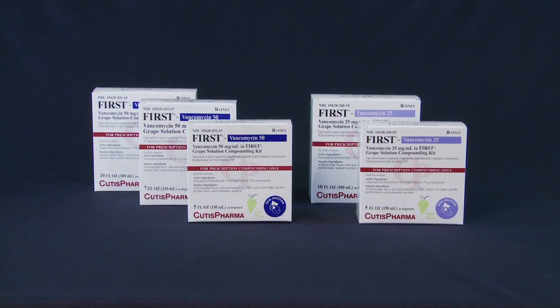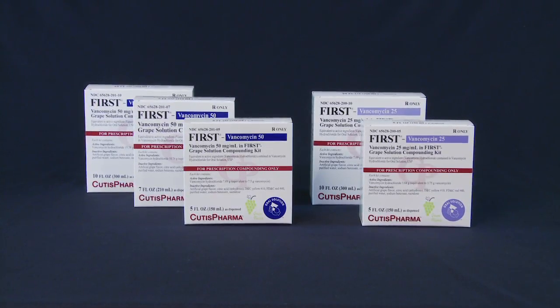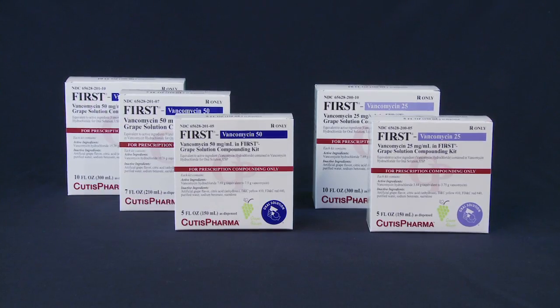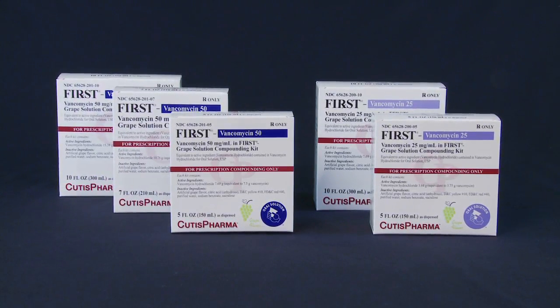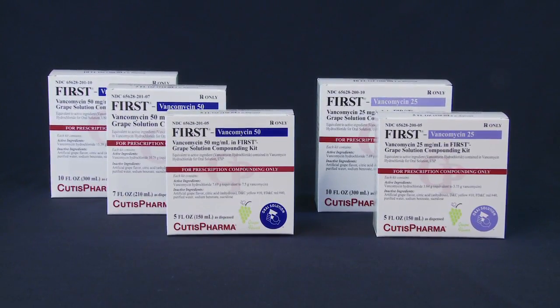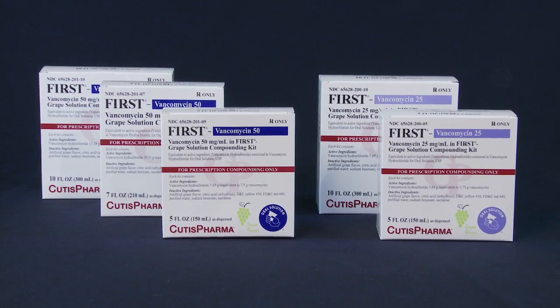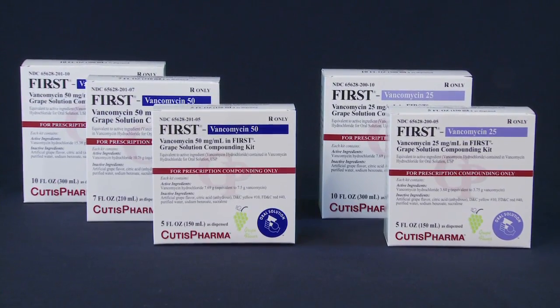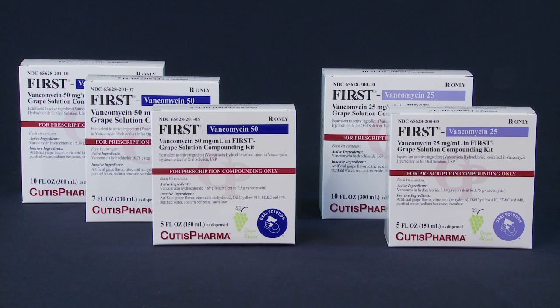FIRST Unit of Use Compounding Kits make vancomycin oral solution compounding fast and accurate. Everything you need to compound 5 or 10 ounces of vancomycin 25 mg per milliliter, or 5, 7, or 10 ounces of vancomycin 50 mg per milliliter oral solution, is included in these easy-to-use kits.